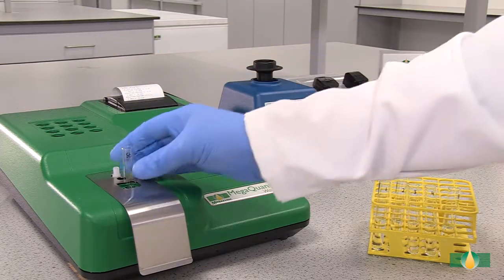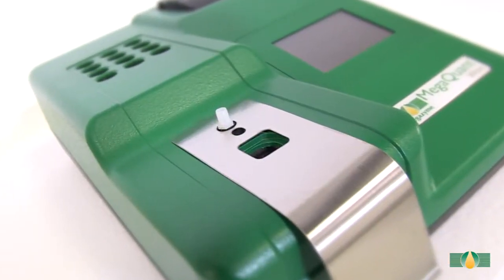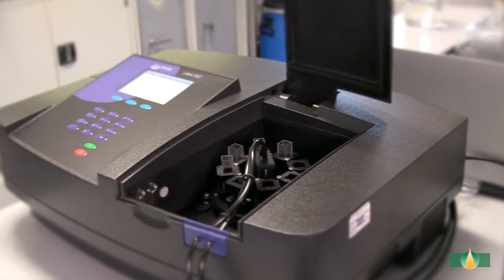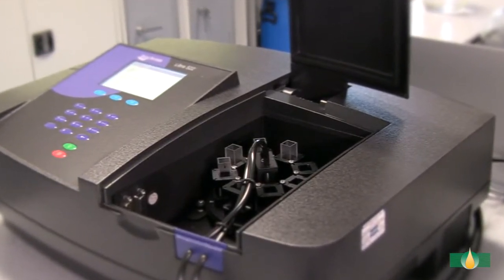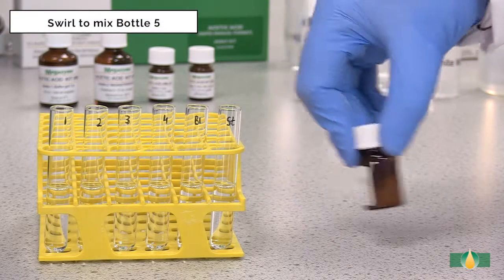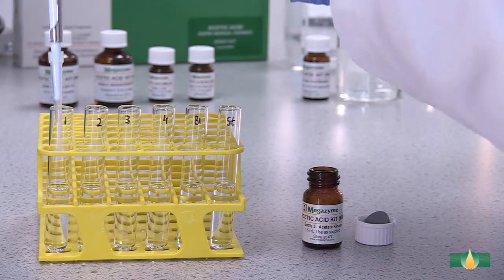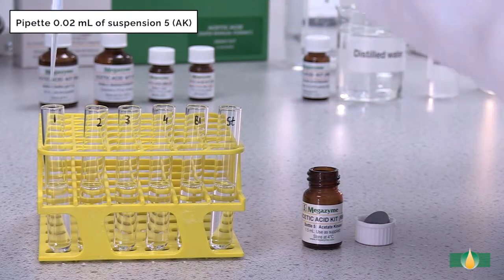In this demonstration, we are using the MegaQuant Wave spectrophotometer set to read at 340 nanometers. Alternatively, a recording spectrophotometer with 1 cm path length cuvettes can be used. Swirl to mix the contents of bottle 5 prior to dispensing. After recording the A1 absorbance value, pipette 20 microliters of the trigger enzyme, acetate kinase, into all assay tubes.